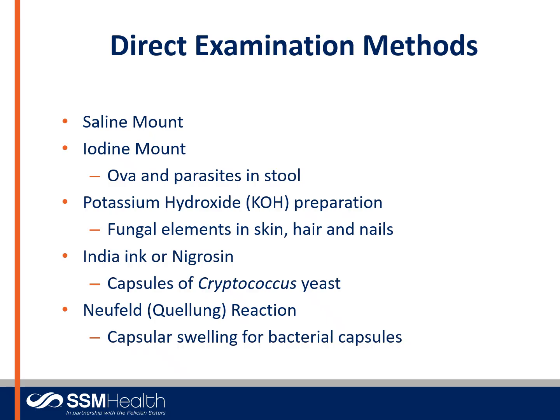And then there is the Neufeld or Quellung reaction, which allows to look for bacterial capsules or the capsular swellings for bacterial capsules. So once again, here's a list of these direct examination methods, and it's helpful to know at least a basic idea of these methods, even if you may not see them while you're doing your clinicals.